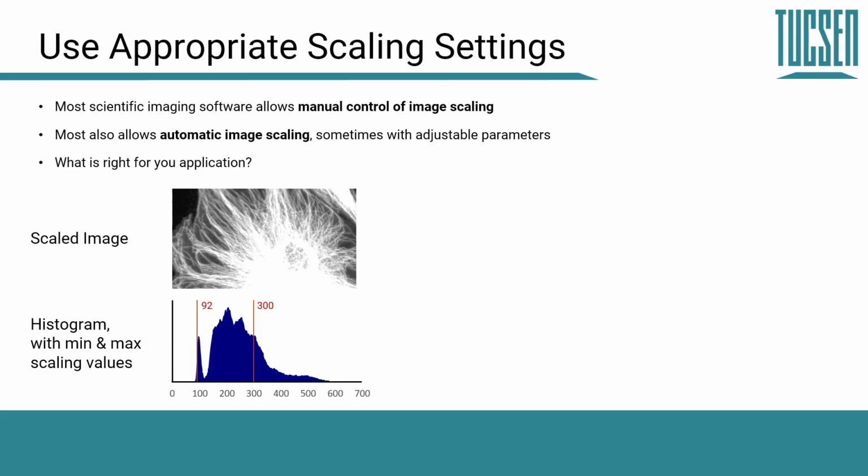There might be many applications where there's something very bright in our image which isn't actually what we're interested in, and we want to really zero in and see what's happening in a darker area of the image, or in a particular scale, a particular area of intensities.